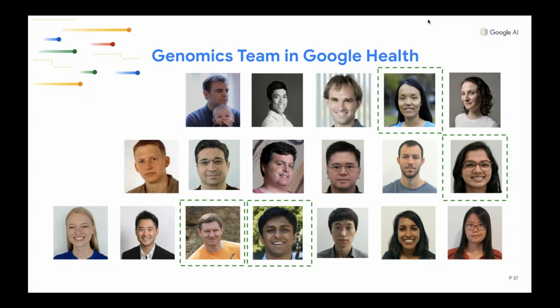So we're exploring the ability to train plant models or non-human models that should give tailored performance to more complex genomes. I will point out that we've done a benchmark on the 3,000 rice genomes, so we have some metrics which indicate that it performs quite well. But I think in the near future, we'll be looking to put out a non-human model.